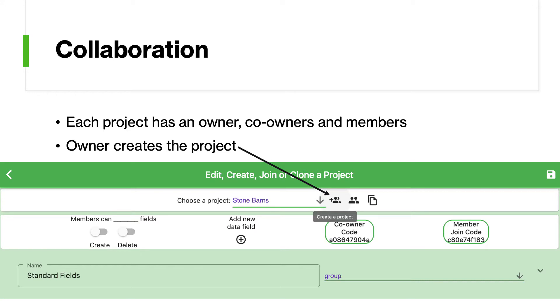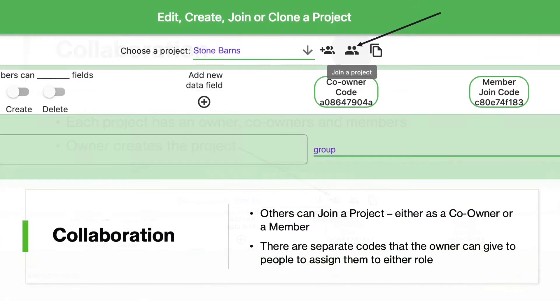In the project management screen, there are three icons to the right of the project chooser. Clicking the first icon opens a dialog for you to enter the name of the project. The middle icon allows you to join a project. For any project, there are two codes: a co-owner join code and a member join code.